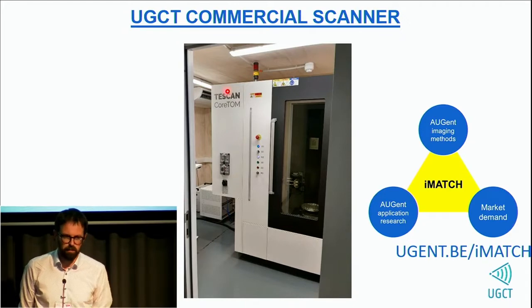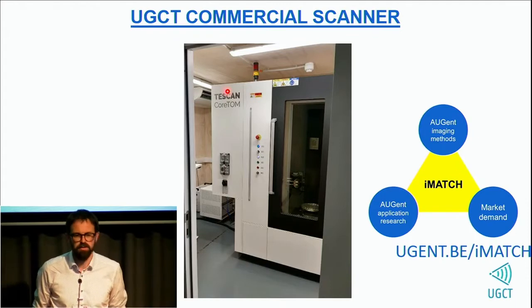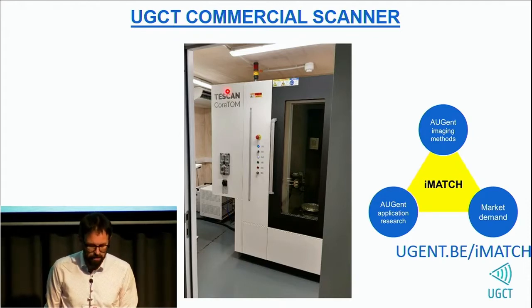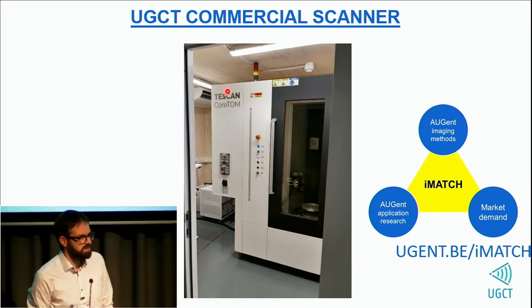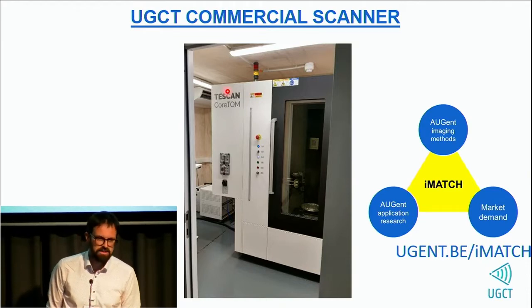It's actually a broader platform for industrial services, not only offering CT, but also other modalities. But CT is one of the main strengths of that platform. We will also use this system for academic collaborations, for high throughput and things that need less configuration or adaptation of the systems, obviously.